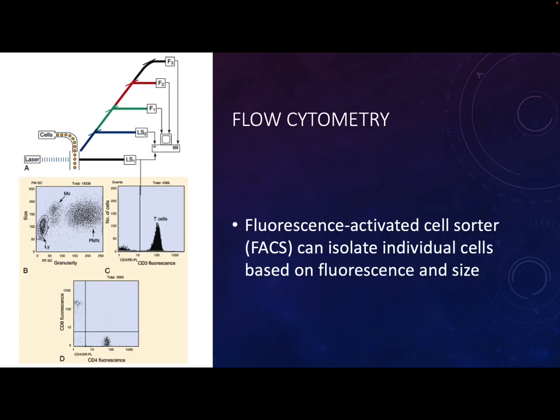Flow cytometry is another type of immune assay. It actually separates cells out. So you can separate cells out by size, and you use antibodies to pull them out. One application of this is how you can count a patient's CD4 positive T cells when they have HIV. Because the clinical progression of HIV to AIDS, part of it is dependent on the concentration of T cells in that patient.